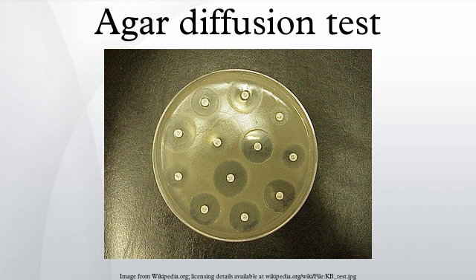Incubation procedure: Using an aseptic technique, place a sterile swab into the broth culture of a specific organism and then gently remove the excess liquid by gently pressing or rotating the swab against the inside of the tube. Using the swab, streak the Müller-Hinton agar plate to form a bacterial lawn. To obtain uniform growth, streak the plate with the swab in one direction, rotate the plate 90 degrees and streak the plate again in that direction. Repeat this rotation three times. Allow the plate to dry for approximately 5 minutes.